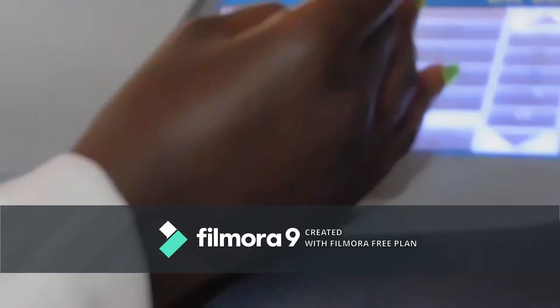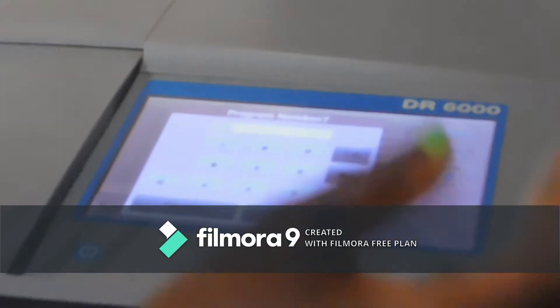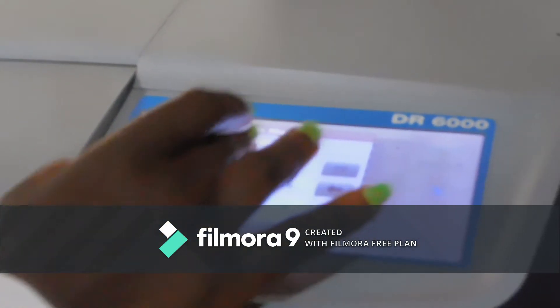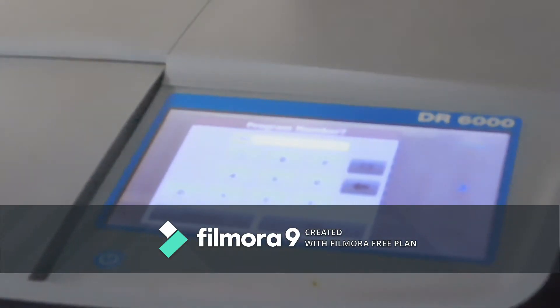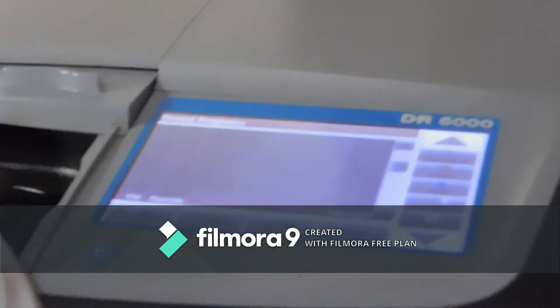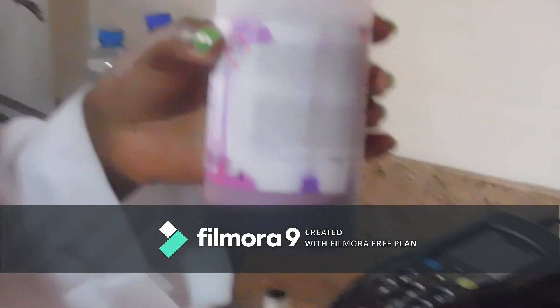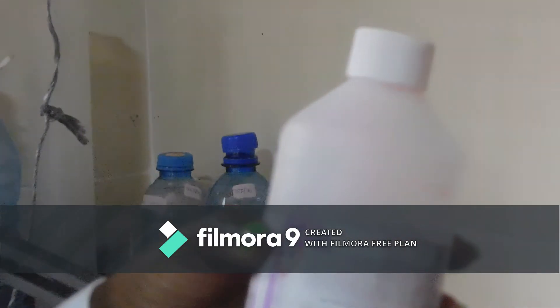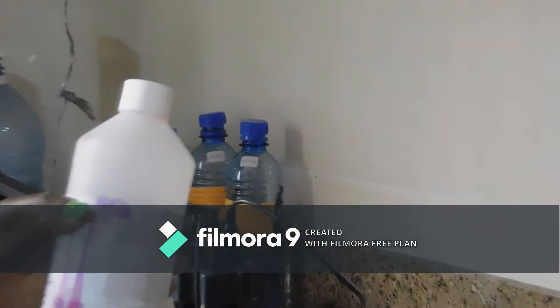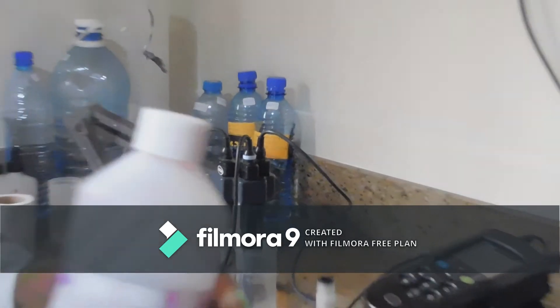For example, we are analyzing fluoride. You just come to the stored programs and select the number that is programmed. For example, fluoride is program 180. You select the number and press OK. And then you add the reagent. For fluoride, you use the SPADNS reagent. Basically, when you are analyzing different parameters, you are supposed to use different reagents.